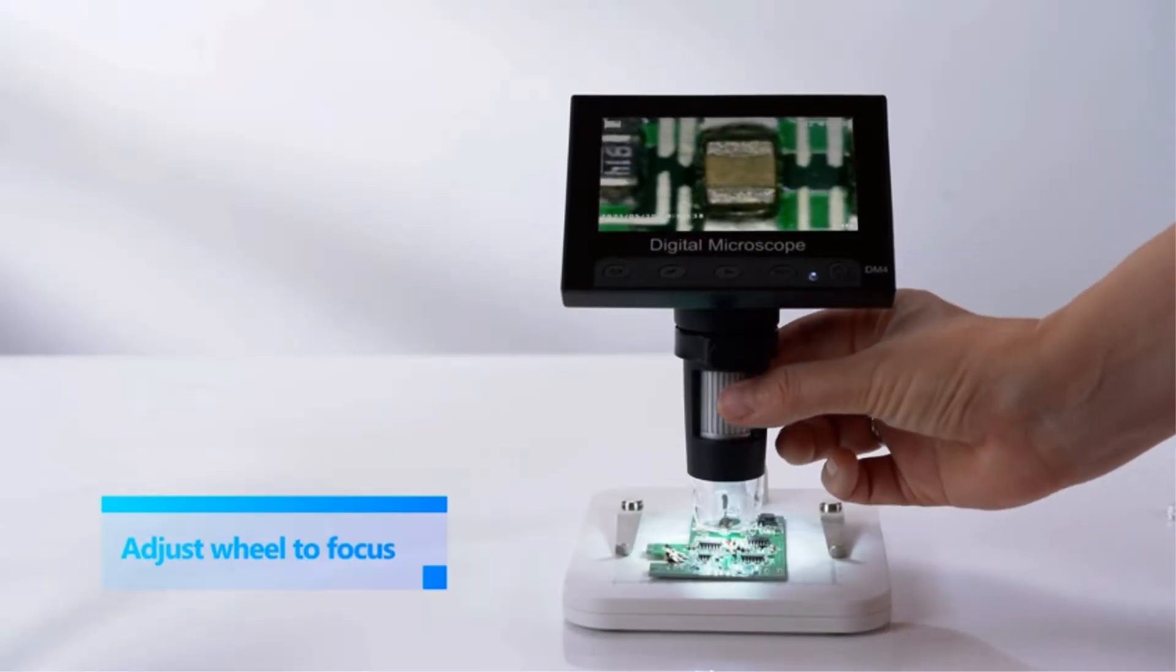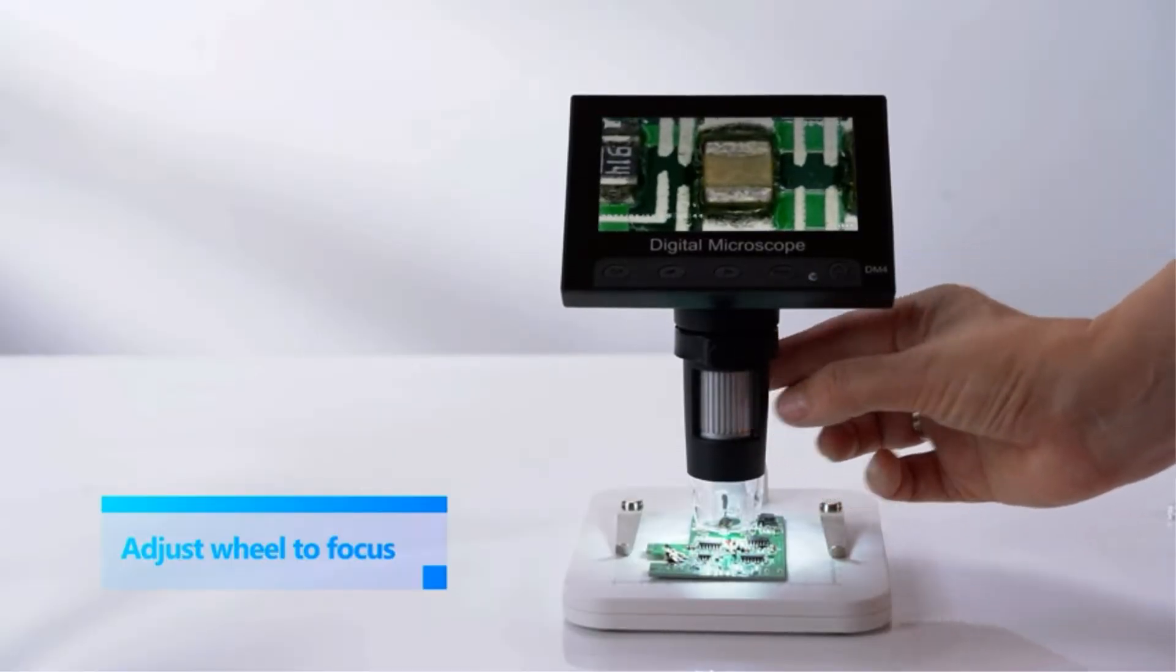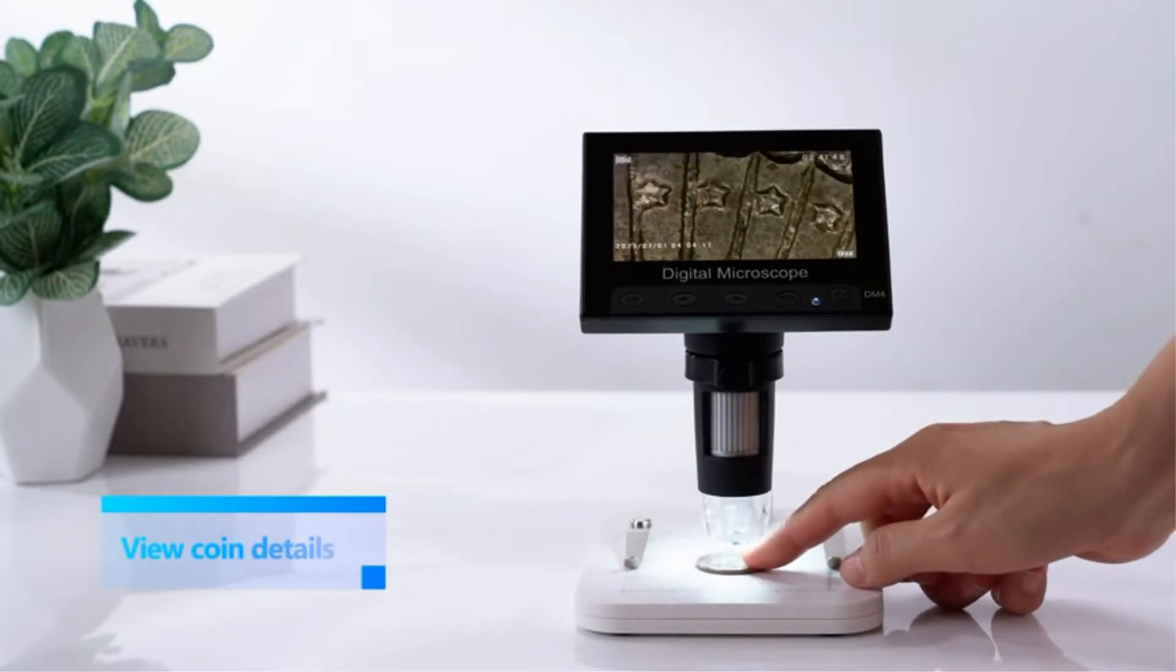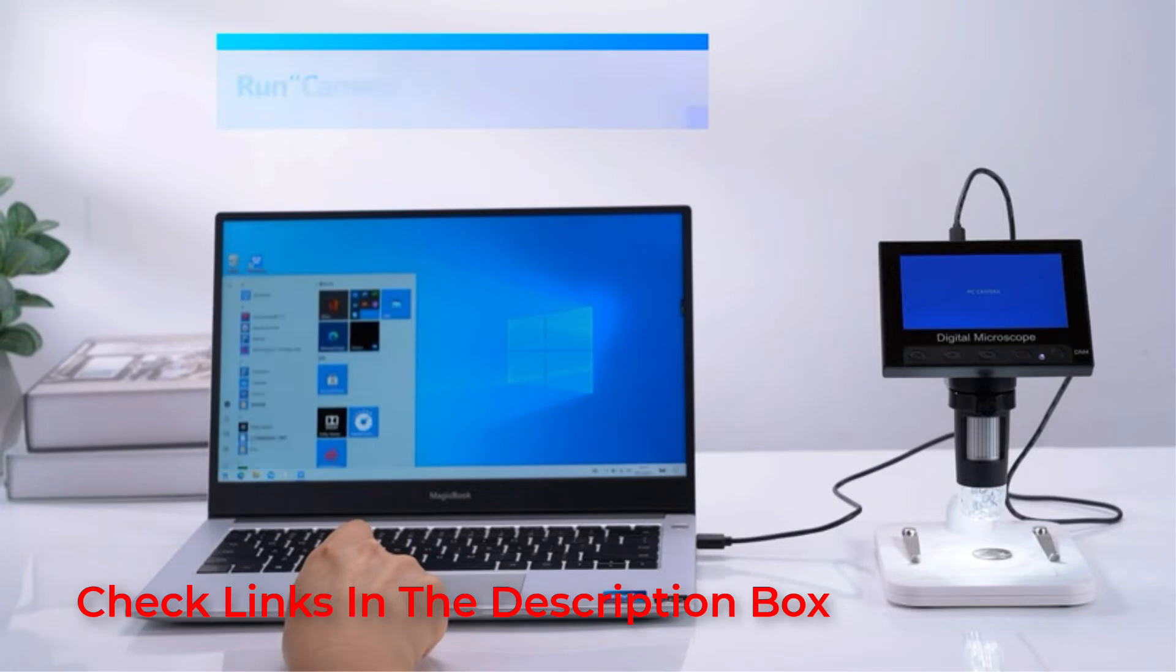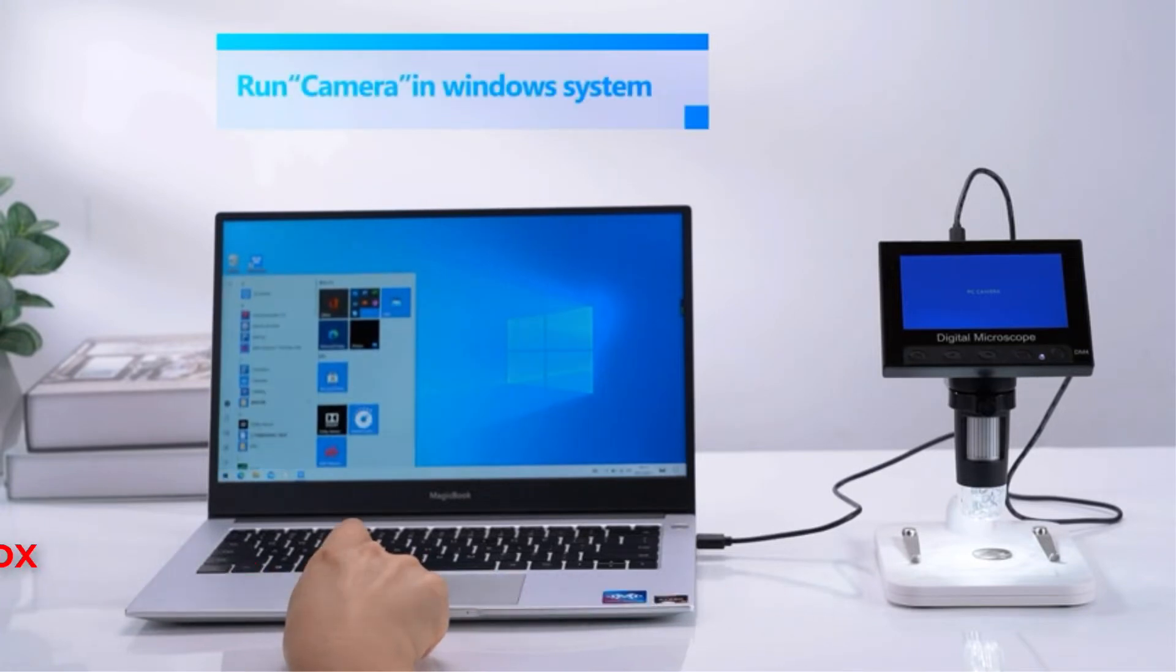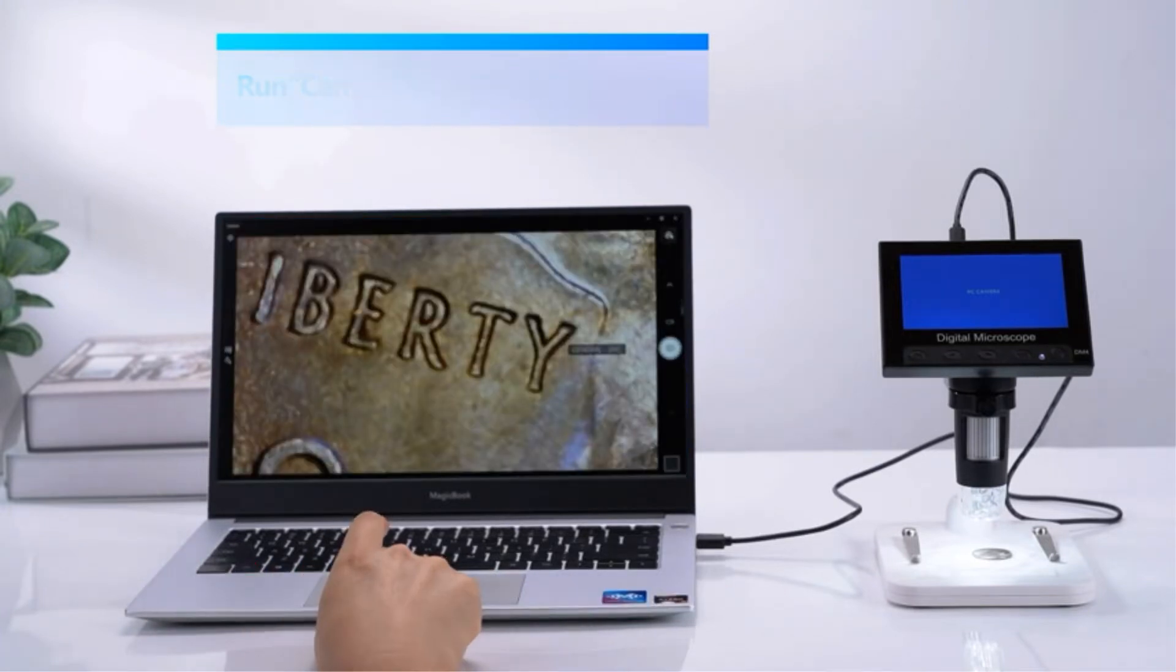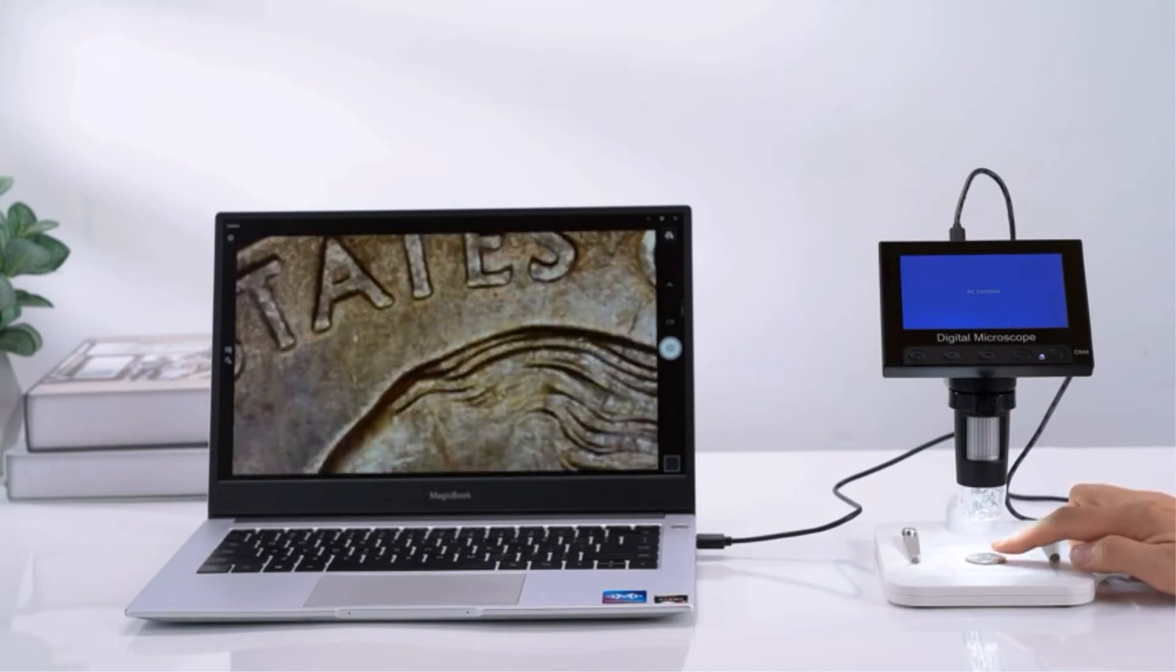Elliclove's digital USB microscope comes at the first position of this list as this is the cheapest option mentioned here. Because of its low price tag, it is a great option for buyers on a budget. Although, the lower price tag does mean that you get a small display size of just 4.3 inches.